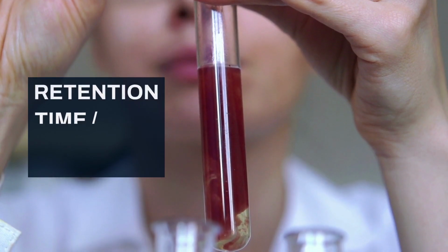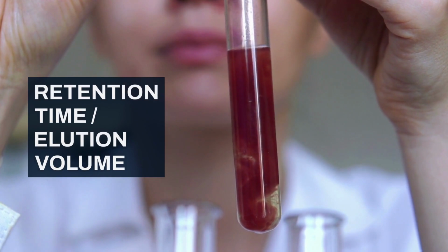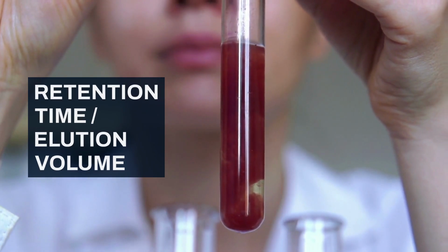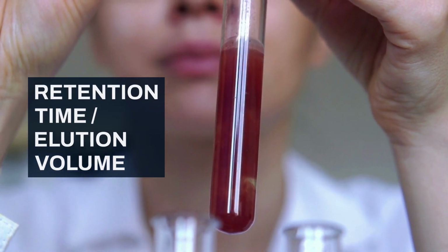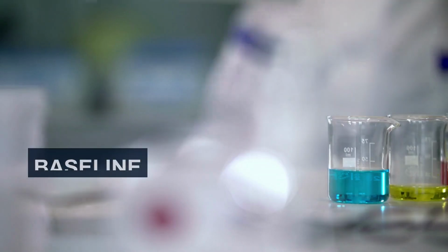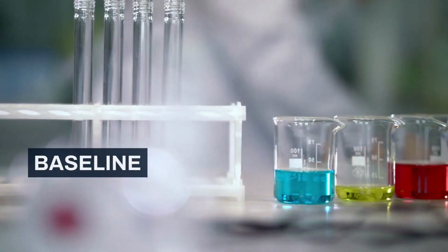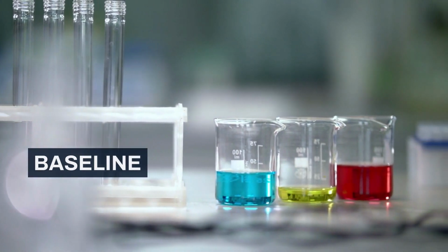The position of the peak on the x-axis, its retention time or elution volume, is crucial. This position helps you identify the substance. Different molecules will have different retention times because they interact differently with the column. The flat line before and after the peaks is called the baseline. This shows that no significant amount of your target molecules is eluting at that moment.